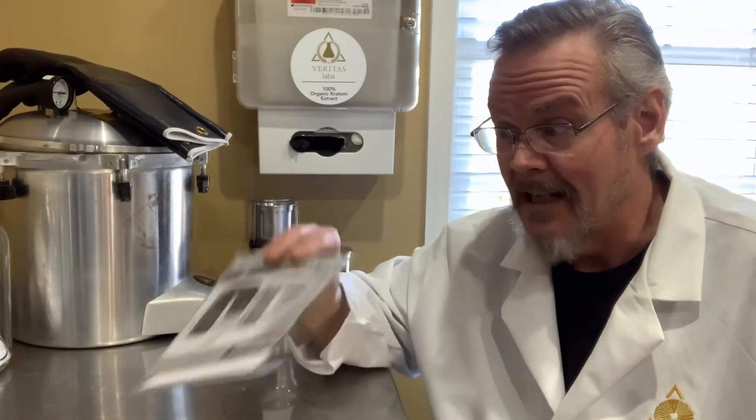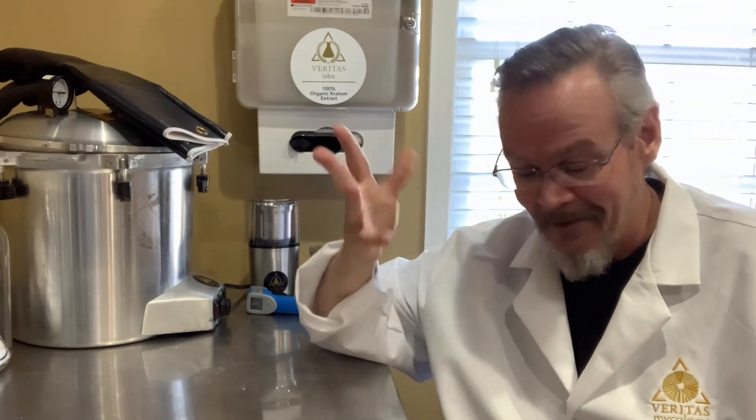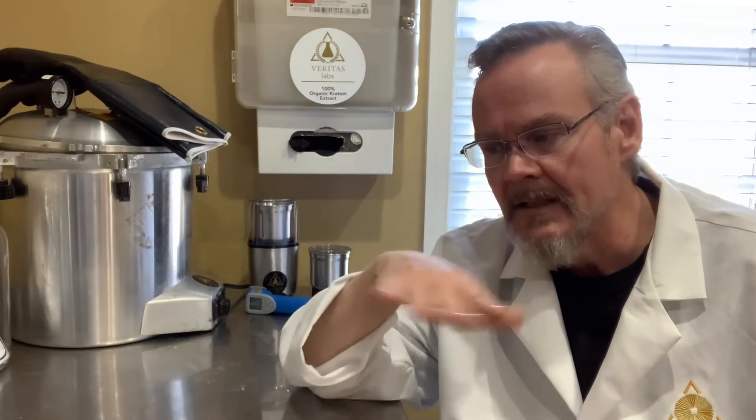Make sure you fill out your warranty card too, because you're going to want to keep this thing. They've lasted a long time — that's why I had to go buy a new one to show you guys what it looks like, because the old ones don't exist anymore. I've had that thing for years and you just can't kill them. They're very basic and easy and simply put together. It's a great design and it works great for our purposes. Thank you all and you guys have a great day.